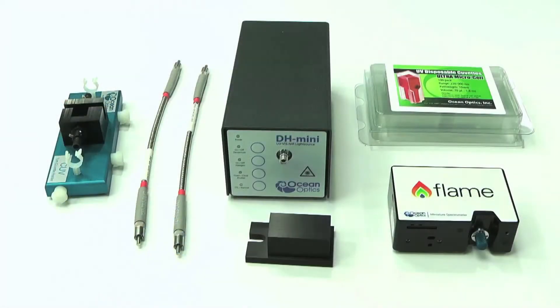The products included are the Flame S UV-Vis spectrometer and the high power DH mini light source with integrated shutter, containing a halogen bulb for visible light and a deuterium bulb for UV output.